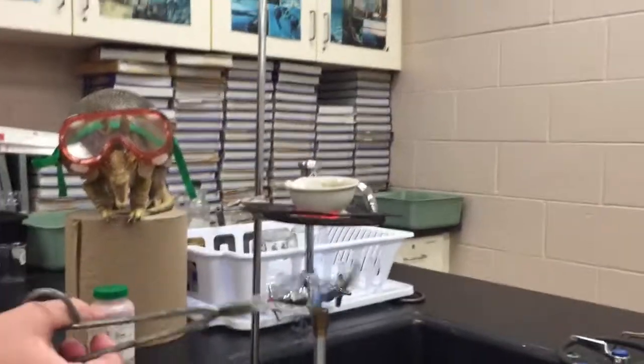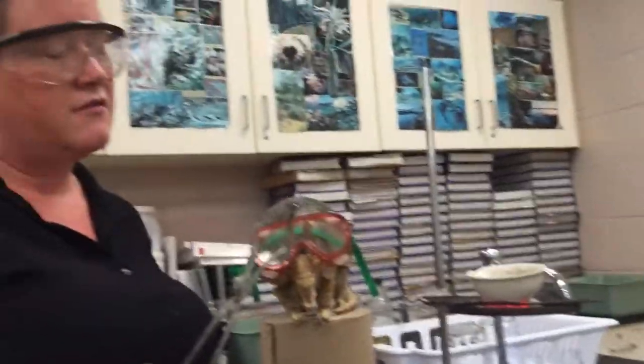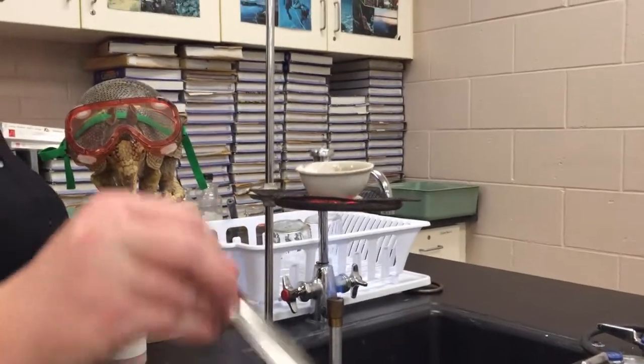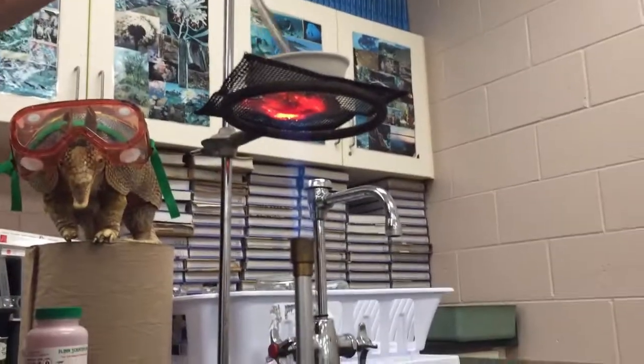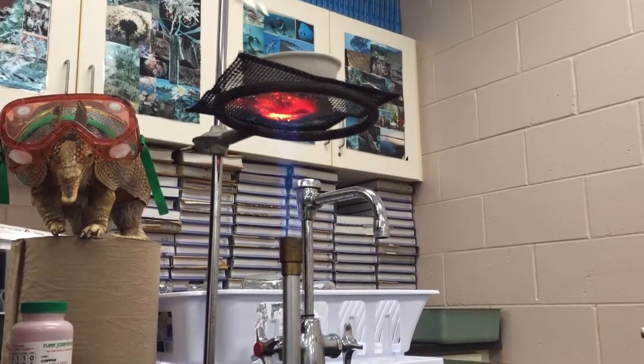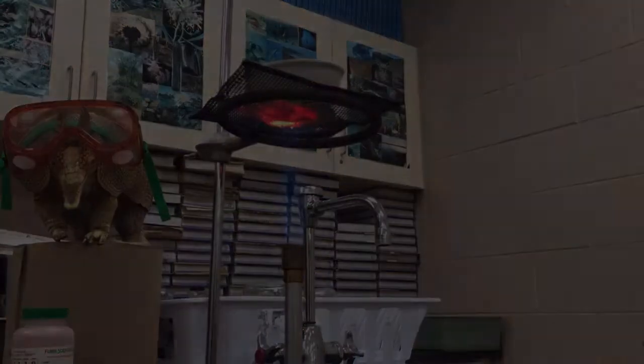I haven't gotten it up above its original mass. I wonder if I continue heating if it will ever eventually get above its original mass, which was 0.42. We'll take a little break and allow this to heat for quite some time and come back in a bit.